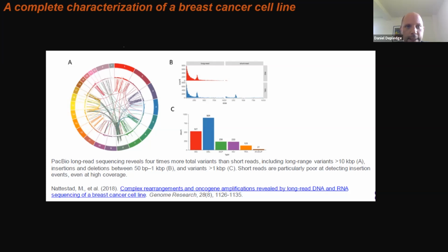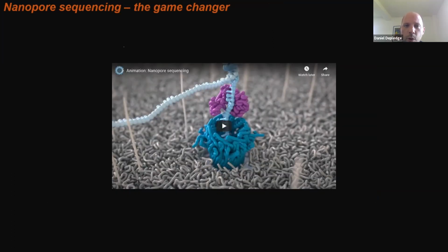But that's pretty much all I'm going to say on PacBio sequencing, principally because I don't work with it very much, and also because I think it's been superseded by the final technology that I'm going to introduce, which is nanopore sequencing. I've got one last video for you to enjoy.